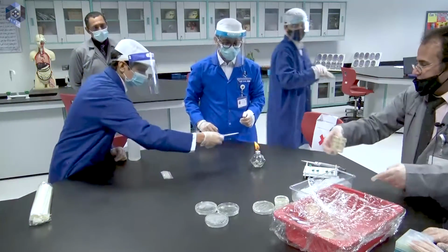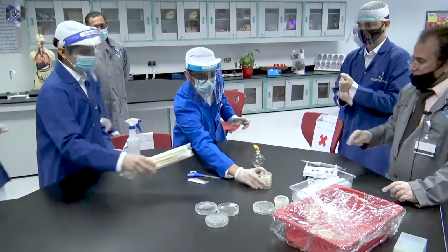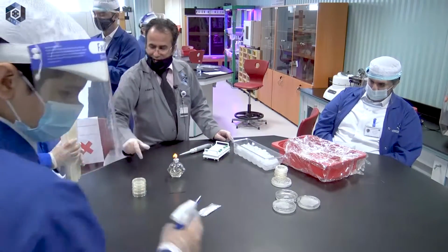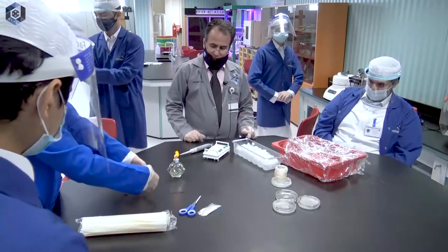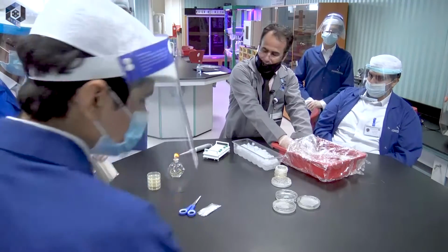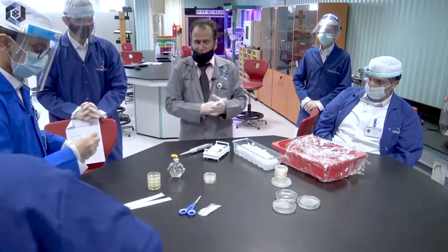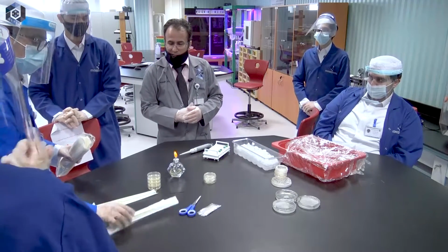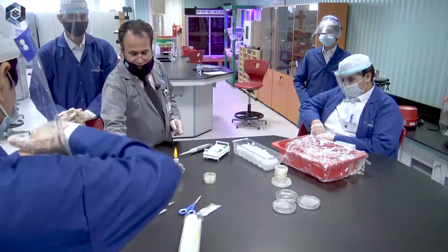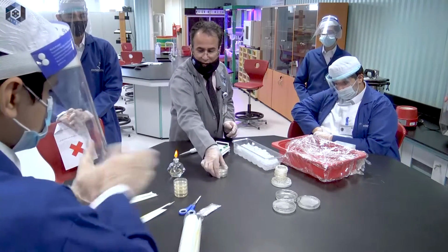These are the Kanamycin plates. Now, we will be using the inoculating loops. Invert them. Now, each of you will culture one of these plates.